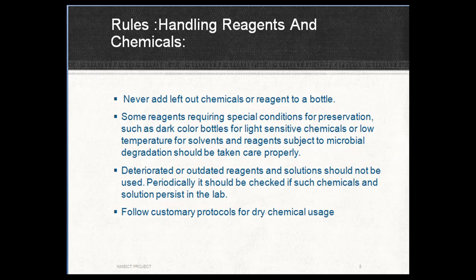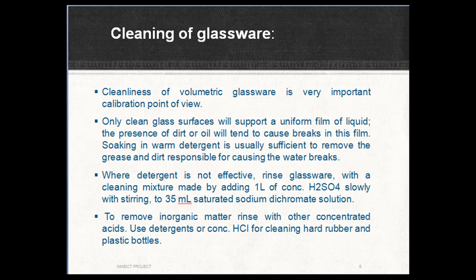Some reagents require special conditions for preservation, such as dark bottles for light sensitive chemicals or low temperature for solvents and reagents. Deteriorated or outdated reagents and solutions should not be used. Follow customary protocols for dry chemical usage. Now let's try to understand the GLP for cleaning of glassware.